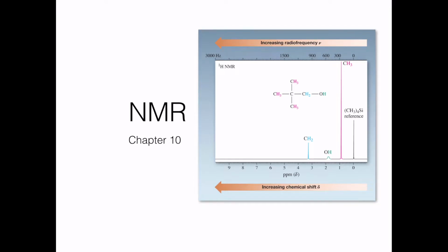In this chapter, we're going to learn about nuclear magnetic resonance, NMR, as it's typically called. A typical NMR spectra looks just like this one for this compound, and the power of NMR is that it gives you the individual hydrogen peaks of a compound. And again, this is a hydrogen NMR. It's really a powerful technique because, again, it gives you the carbon-hydrogen framework. It gives you a tool to depict that.